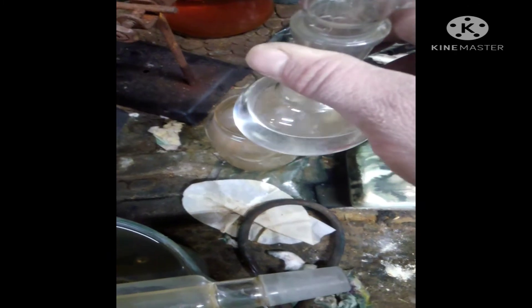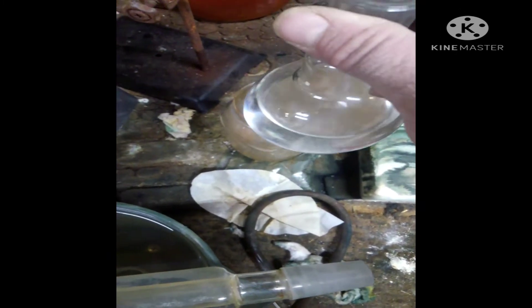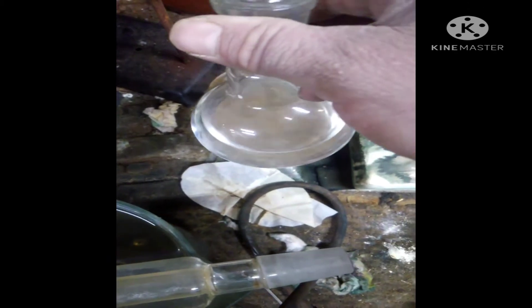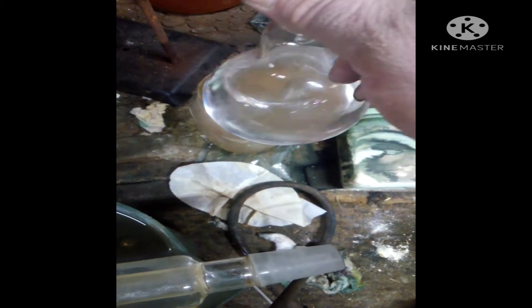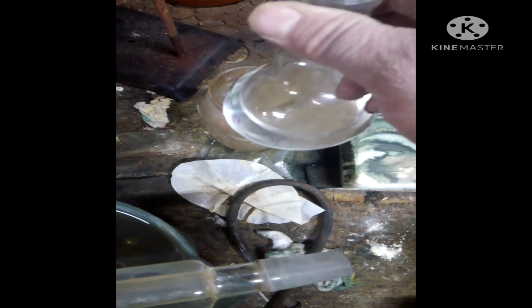I'm all done distilling, so I'm going to measure this out and see exactly how much I have left. Then I'm going to add my glacial acetic acid, followed by the sulfuric acid.